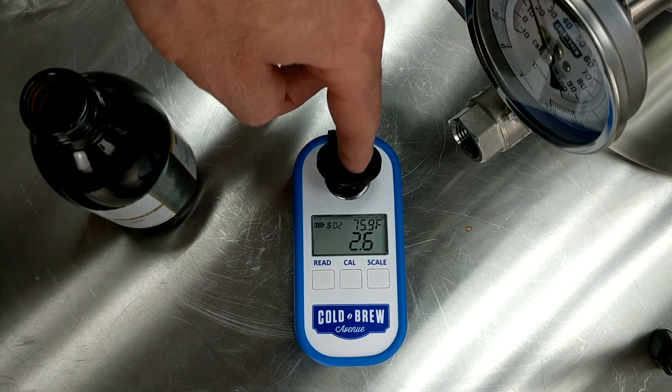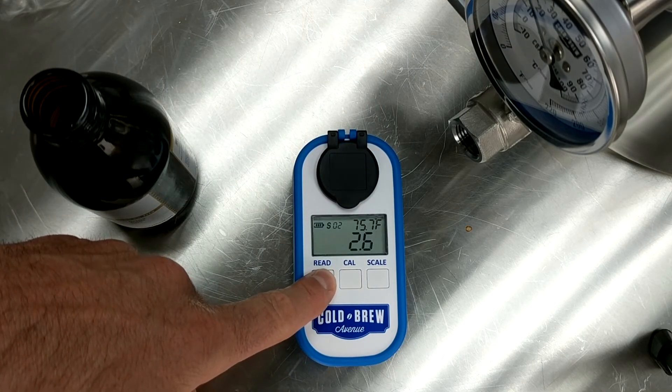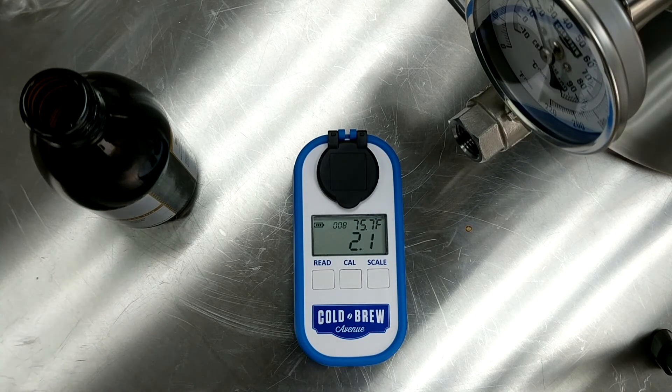If the system is still on and you wish to take another reading, hold down the read button for two seconds and you will see a countdown from 15 seconds as it begins to take your new reading.